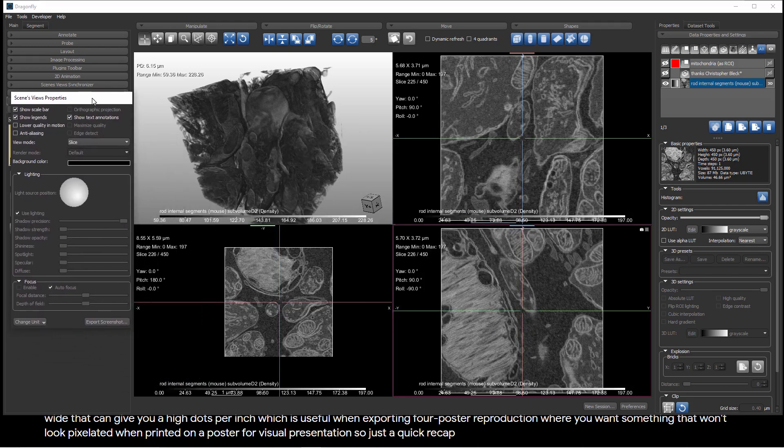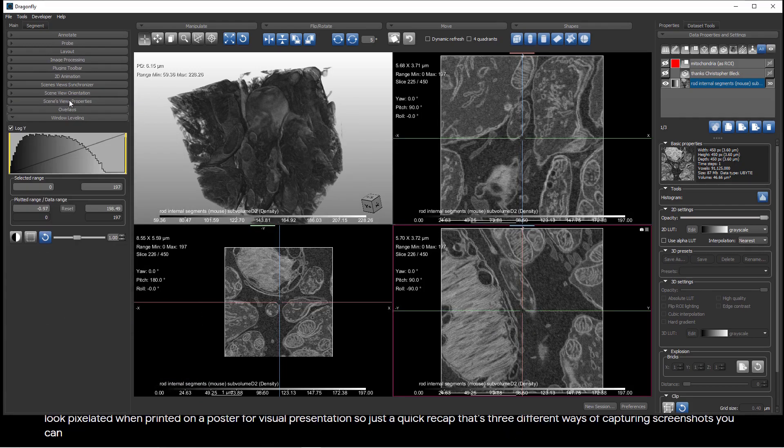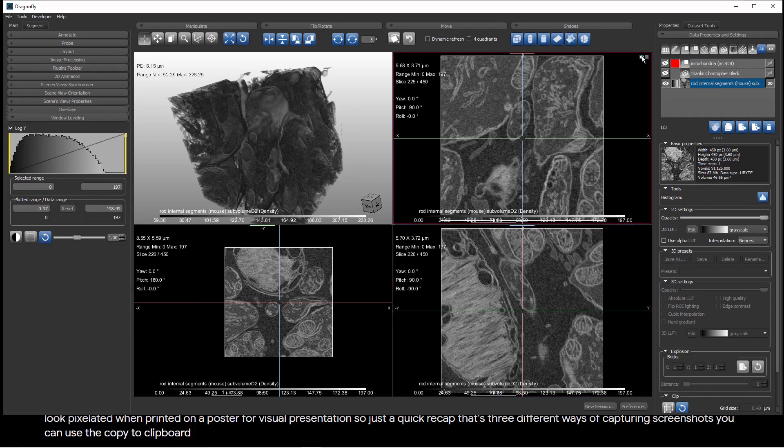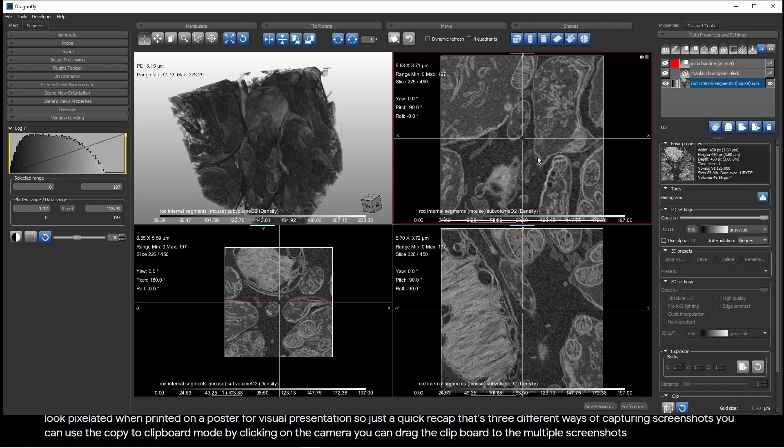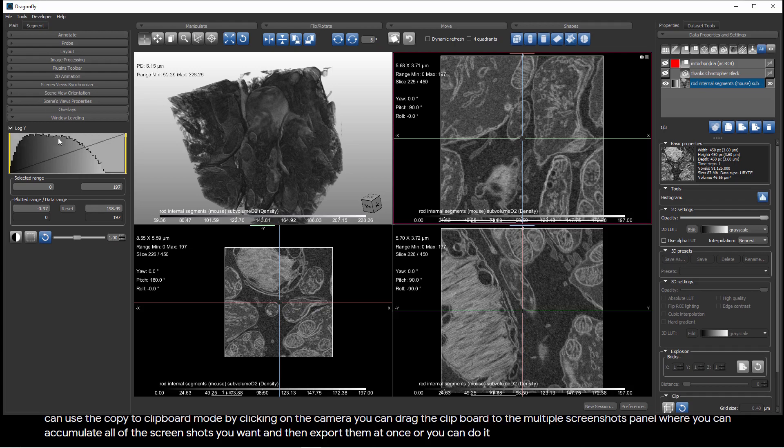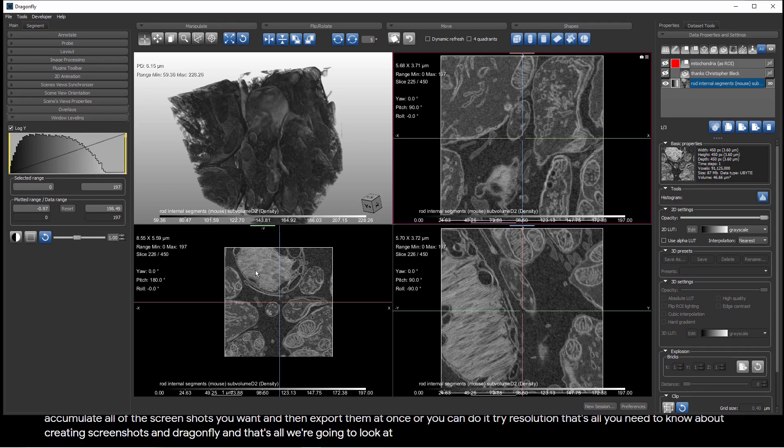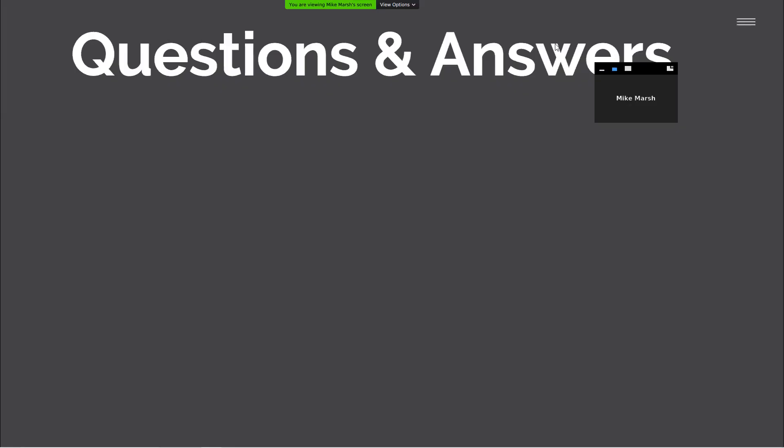So, just a quick recap. That's three different ways of capturing screenshots. You can use the Copy to Clipboard mode by clicking on the camera. You can drag the clipboard to the Multiple Screenshots panel, where you can accumulate all of the screenshots you want and then export them at once. Or, you can do Export Screenshot to Export one at a time at arbitrary resolution. That's all you need to know about creating screenshots in Dragonfly, and that's all we're going to look at in this short lesson of the Dragonfly Daily.